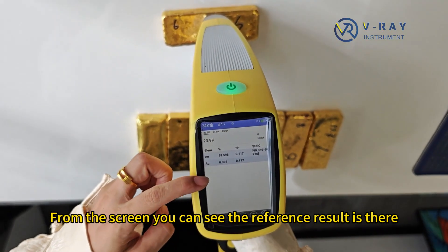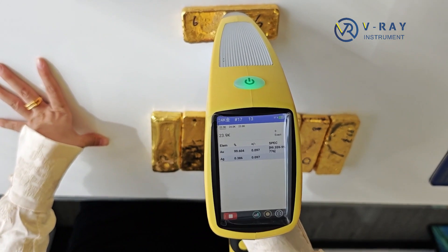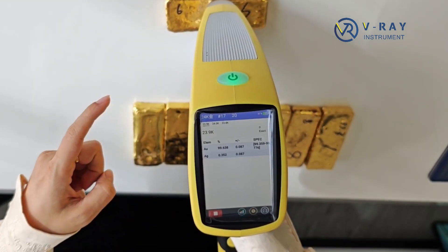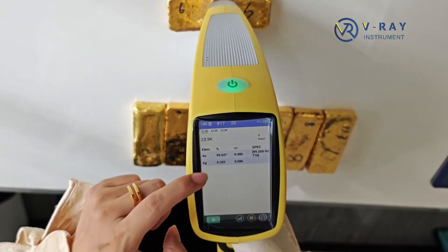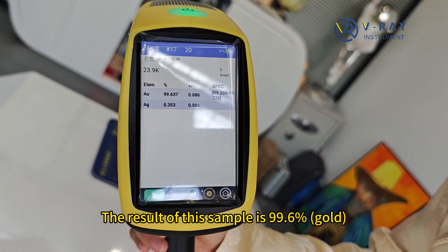From the screen, you can see the reference result is there. Our standard testing time is 20 seconds. After 20 seconds, you can hear there's one sound — ding dong — and then testing is finished. The test result of this sample is 99.6.